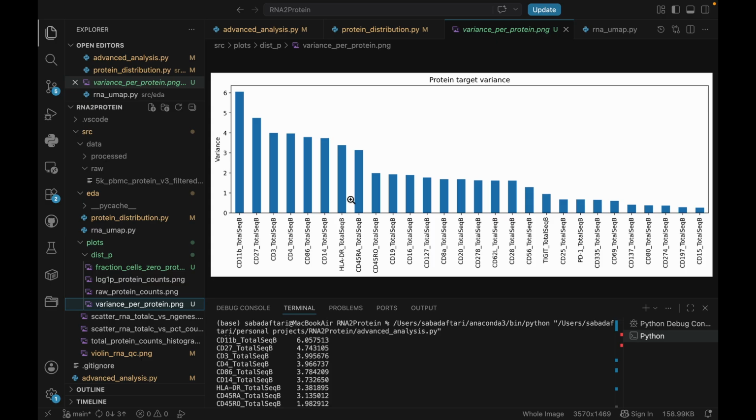If we want a simple model or faster training, we will probably want to remove low variance proteins. But if we want to design a model that handles irrelevant features well, or just want to be conservative and not throw away anything, then we want to keep it.